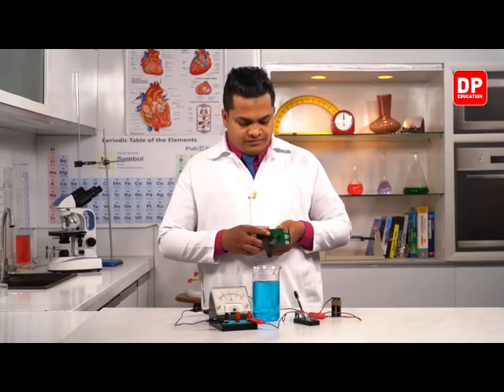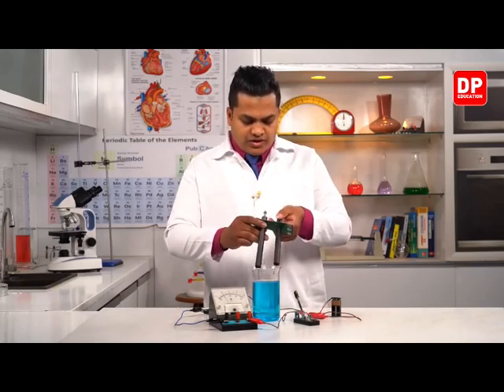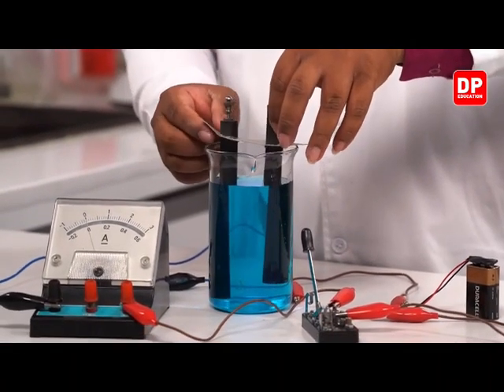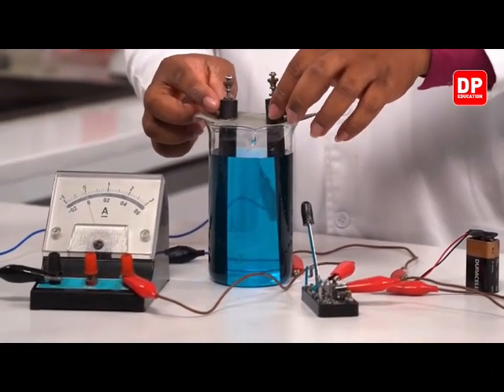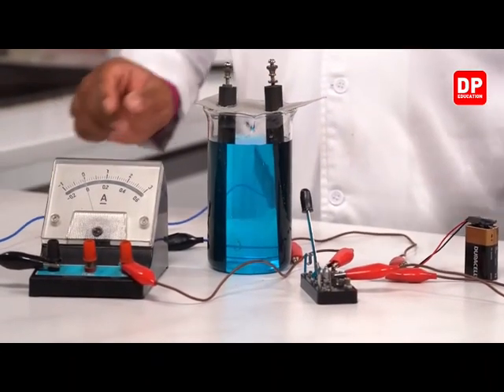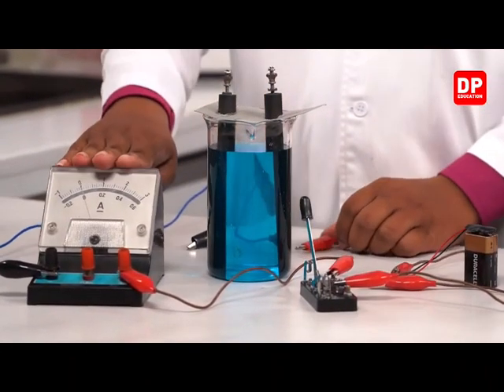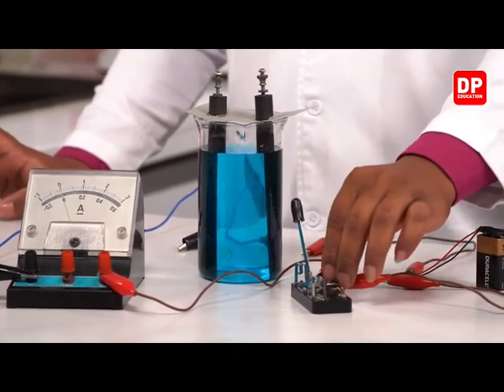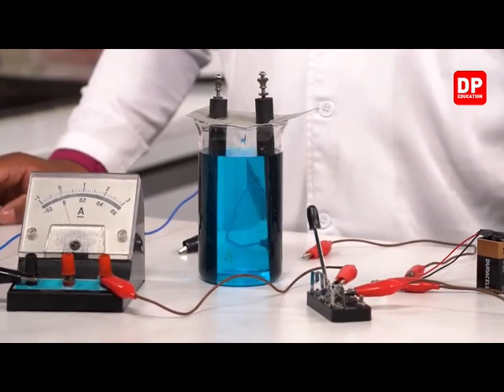Then let's dip these two in the solution. So this is the ammeter, a dry cell and the switch to turn the circuit on and off.